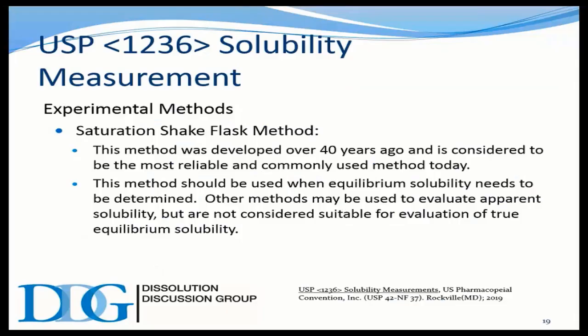I'm going to go over some of the primary components, and Ken's got a nice little follow-up to this on some quick tests that you can do for solubility to look at the range of tests that you could do to narrow down the scope of that project. And this all relates to BCS as well. Classifying as a 1 and 3, which is highly soluble, or a 2 and 4, which are poorly soluble. So there needs to be a method that's used, and shake flask method is the most common.